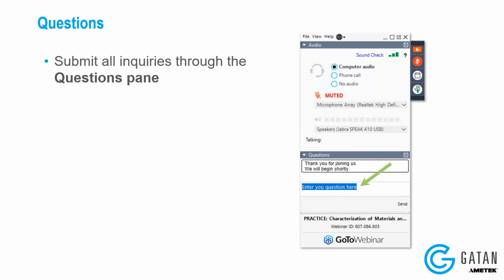But the Metro camera is, I like to use the word accessible. The Metro camera is more accessible than K3. What I mean by that is, number one, the software is much simpler. K3 is very powerful and very flexible, but that also means it's a bit complicated.